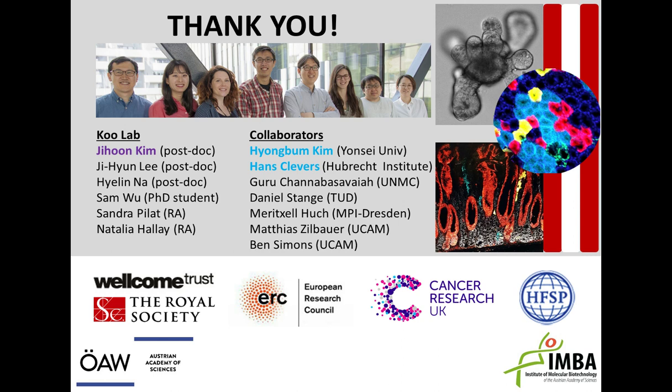Thank you. All right, now when comparing retrovirus and lentivirus for transduction in enteroids, which one is better in your opinion? Well, many people would prefer to work with lentivirus because they are more familiar with it. And the reason that lenti is more preferred in general is that it can also infect non-dividing cells.